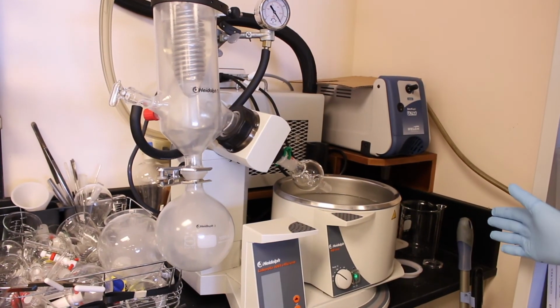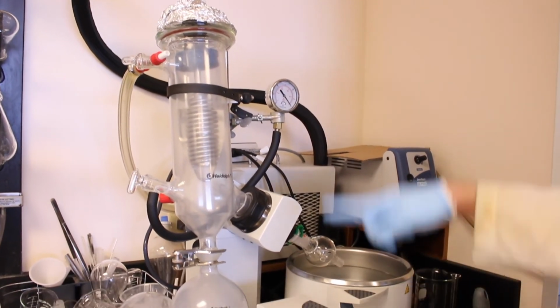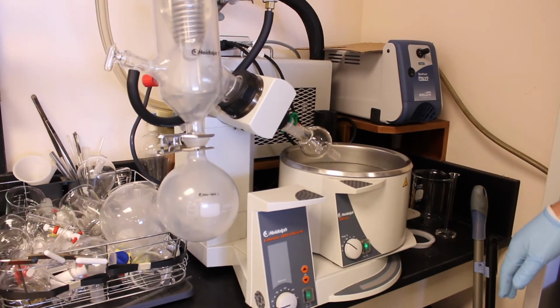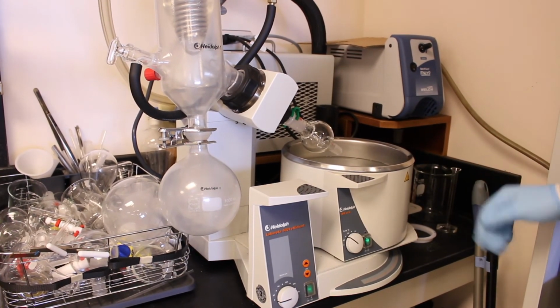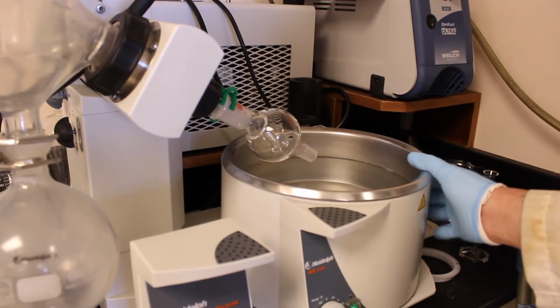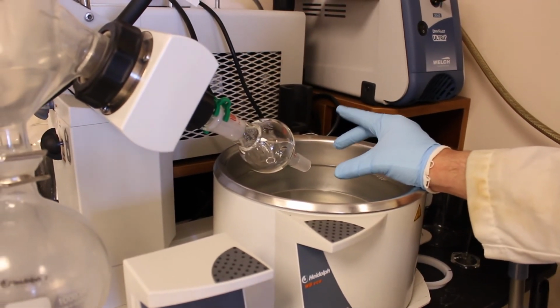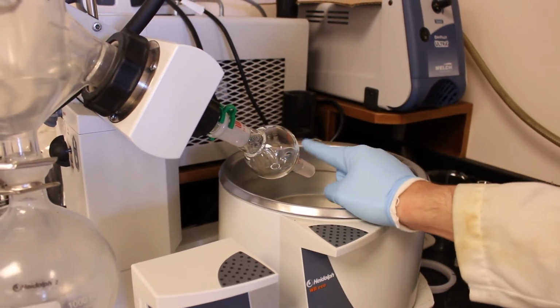Alright, so this is the rotovap, which stands for rotary evaporator, and this is what this entire apparatus is, so let's go through it. A rotary evaporator is basically a glorified distillation apparatus, a glorified vacuum distillation apparatus. So in this water bath will provide the heat instead of a heating mantle, and inside this water bath will be the flask with the solvent that needs to be removed. I don't have it now, but it'll be hooked up to this joint here.